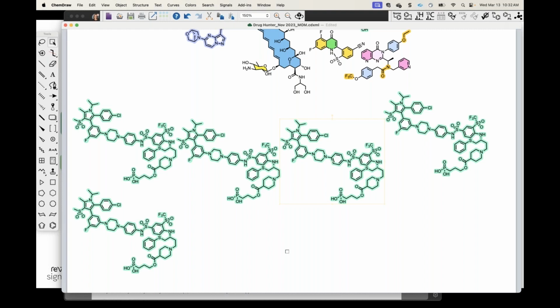So you'll have that capability in both places to make space and have intelligent placement of those newly pasted molecules as you're making different iterations and edits and analogs of things that you may be drawing or editing. So once I save that, all of those changes will now be saved into Signals, and I can access them in ChemDraw.js if I'd like, or ChemDraw Plus rather.